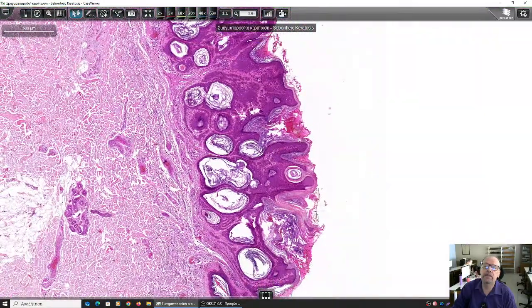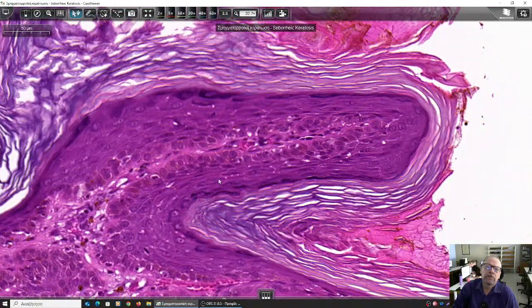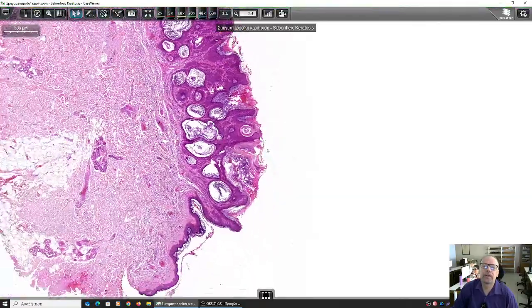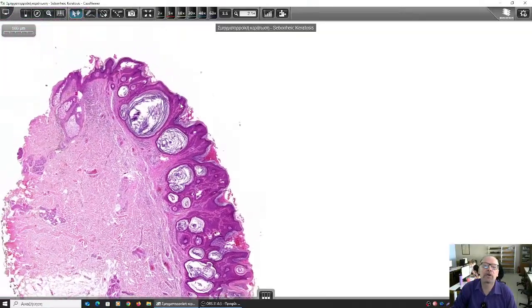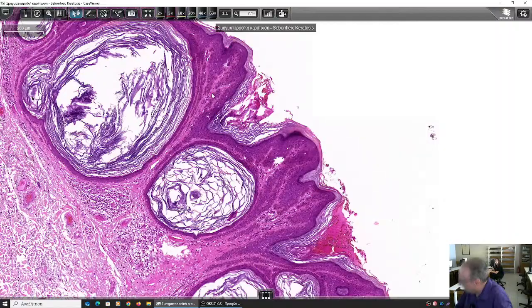And these stalks are lined by cells of the epidermis. So, what are these called? What are these structures called? You see, they're like fingers, finger-like projections. How are they called? You know that? Tell me. Papillae. Yes, these are papillae.